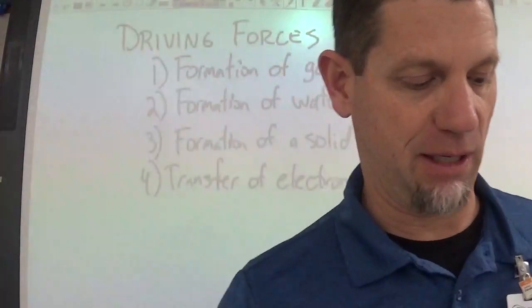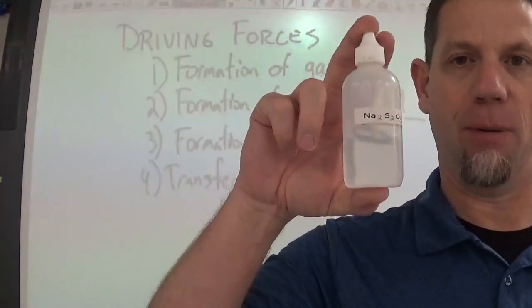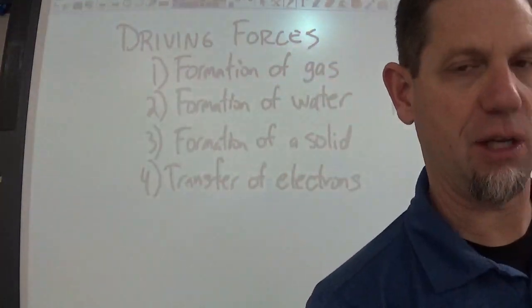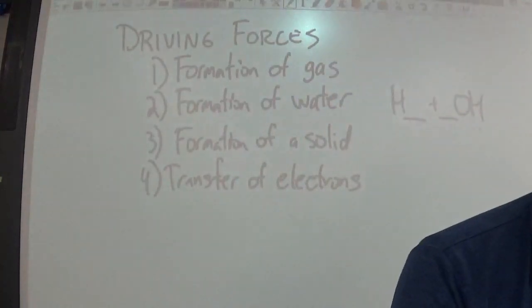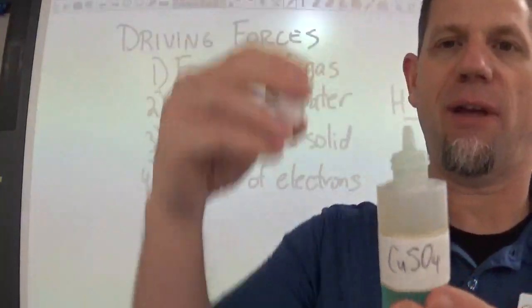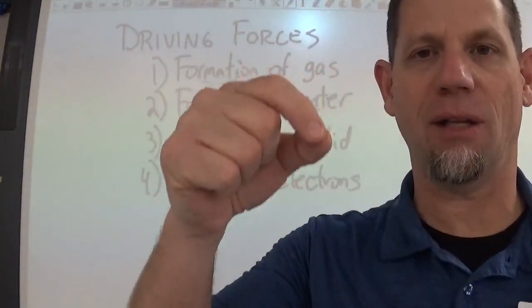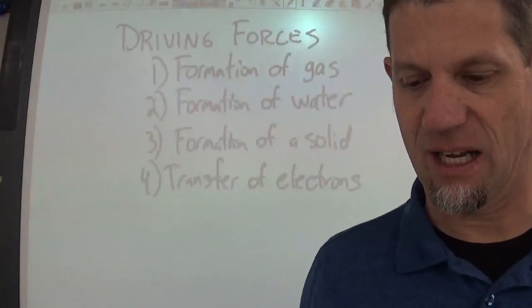So as you mix them together, they're in 4 different types of dropper bottles. There's a big fat dropper bottle, and then there's a tall skinny dropper bottle, and then there's another short fat dropper bottle, and then the 4th kind is the one that I have to warn you about. On these, this screws off and it reveals the dropper part. And you turn it upside down, you squeeze it gently, and you release a drop or 2. I think in this experiment you're going to be mixing like 10 drops.